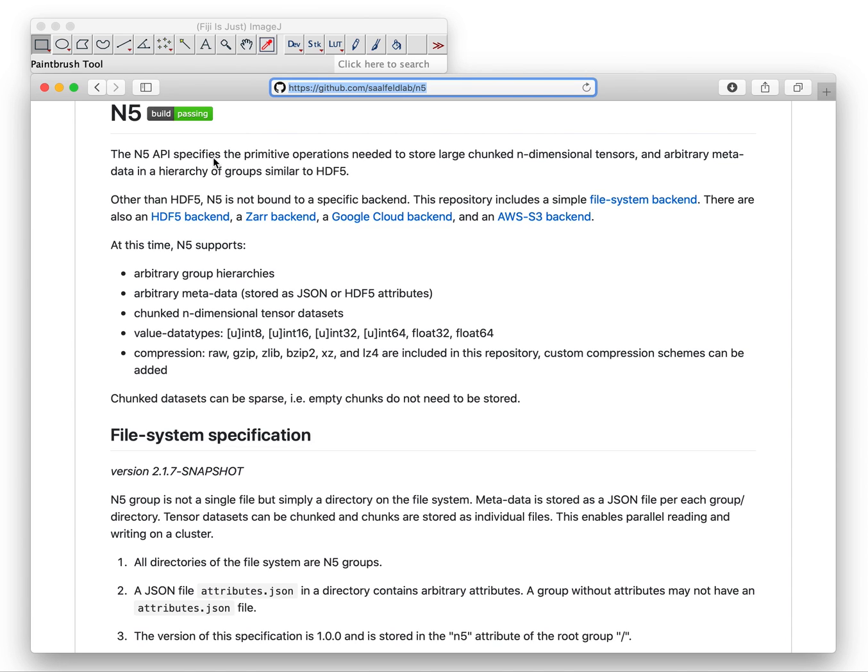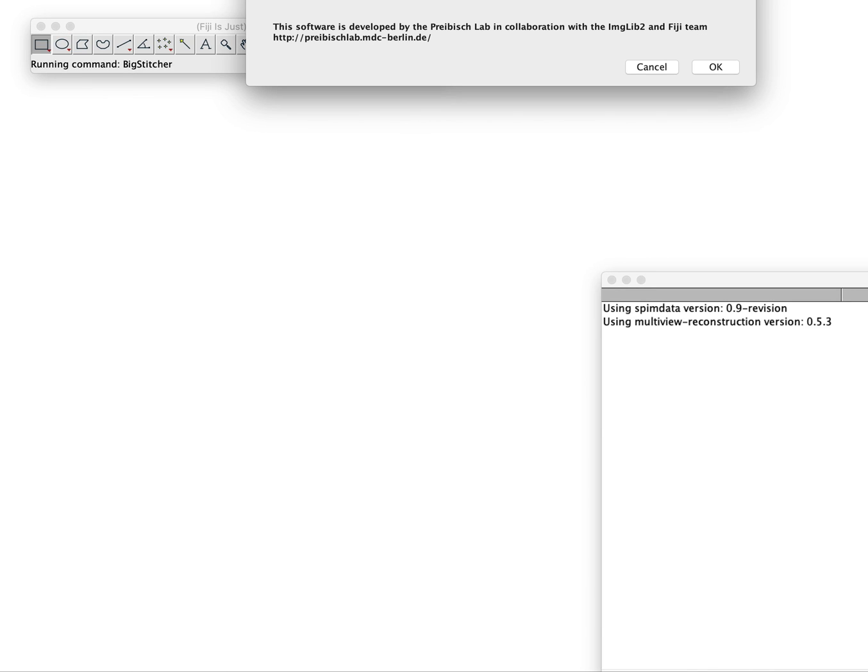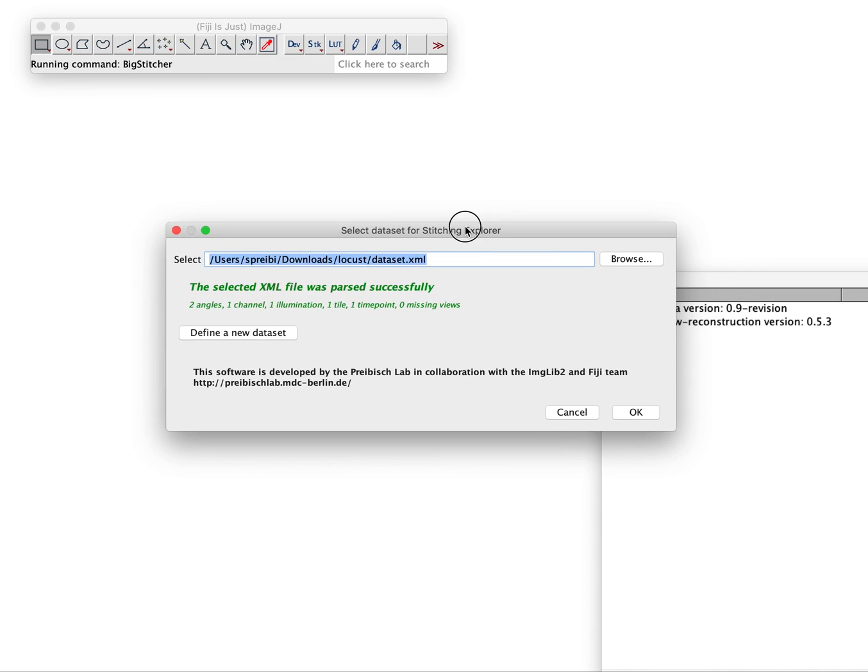The cool thing is in BigStitcher you can now choose HDF5, N5, your call. So I just wanted to show you this here. Now let's get started. We go to Plugins, BigStitcher, BigStitcher. When you define a new dataset you can choose to save it as N5 in two ways and I will show you both of them now.